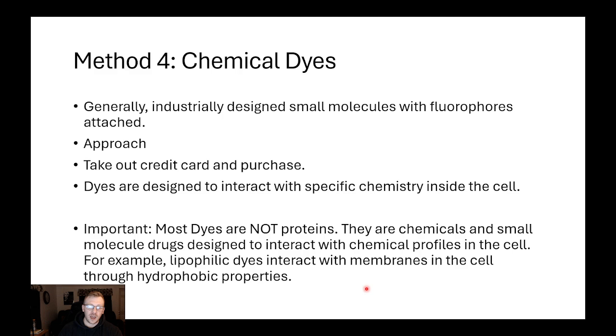And then you can dye your large structures like your lipids inside the cell and then have a secondary fluorescent molecule like a protein or an antibody that looks at a specific structure. So don't rule out dyes just because they're not specific. They have their place. They're just going to be a little more niche, I would say, than the actual protein-specific labeling methodologies.